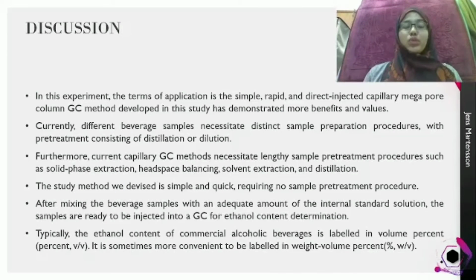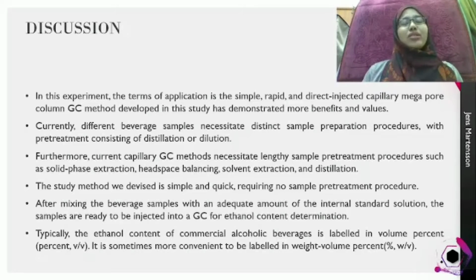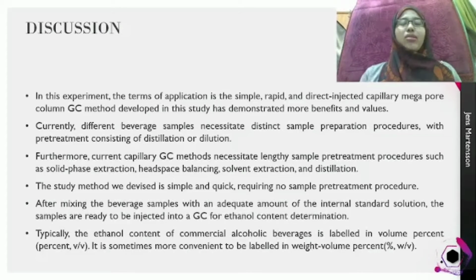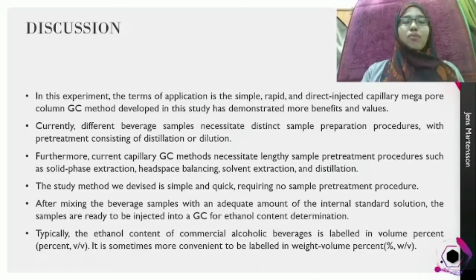Assalamualaikum warahmatullahi wabarakatuh. My name is Nur Hanani Fatiha binti Azhar, and in this slide, I will present the discussion for experiment 5. In this experiment, in terms of application, the simple, rapid, and direct injected capillary megabore column GC method developed in this study has demonstrated more benefits and values.